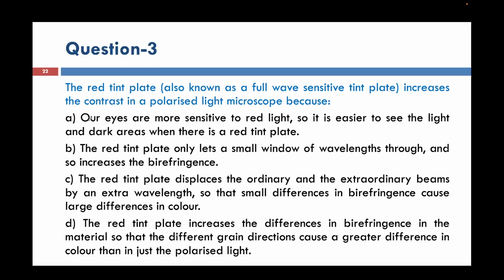So can anyone guess the correct answer? Sir, I think D is the answer, the red tint plate increases the difference with different grain directions.